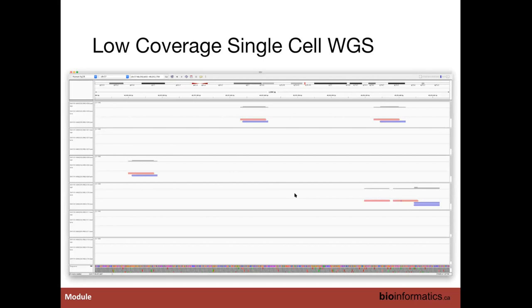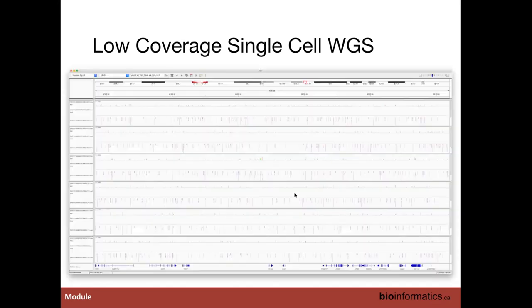Here's a first look at low coverage single cell whole genome sequencing — the data type I'll talk about most. This encompasses DLP, and 10x CNV would also have been a low coverage technique, while some techniques like DOP-PCR are a bit higher coverage. This is what you would first see when you open up one of the BAM files in IGV. As we zoom out, we can see that on average we get even coverage, and that coverage when we look at any two cells isn't biased to particular regions — which is what DLP and others have optimized for.